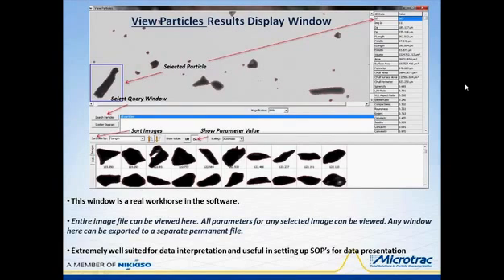in the upper left. The particle in the blue box in the frame shot, upper left, has the values of all of its parameters displayed under data in the column in the upper right, in either the 2D or 3D mode. The numerical value of the sorted parameter can be turned on or off in the image file. Images can be sorted on any selected parameter.